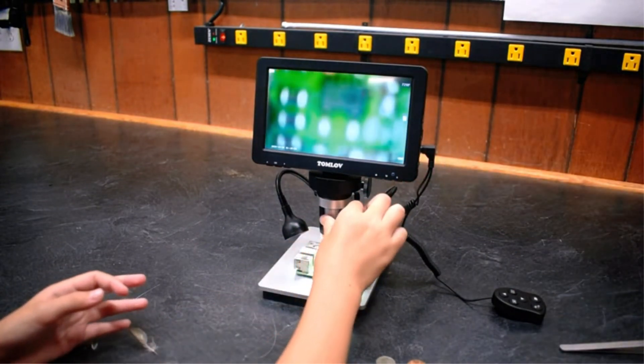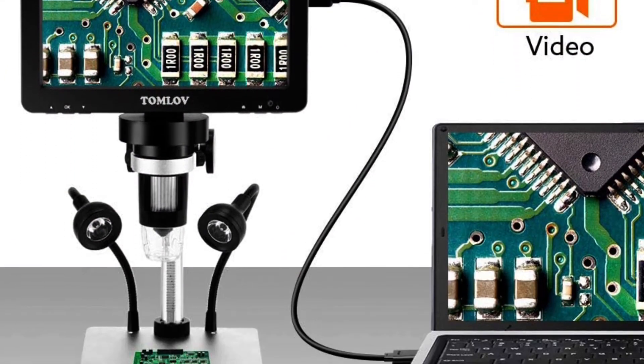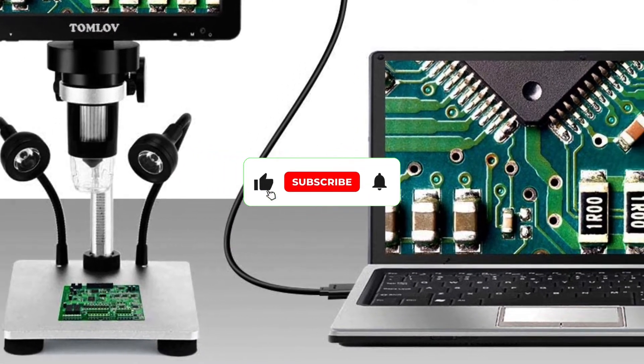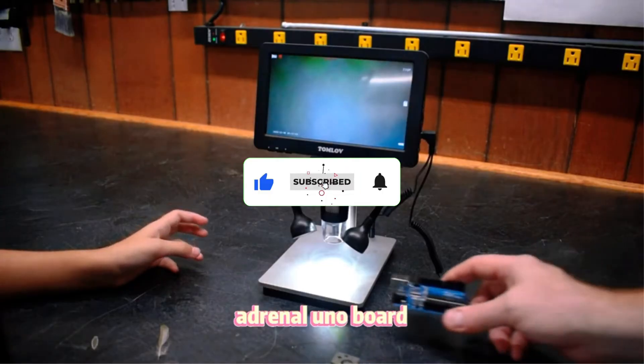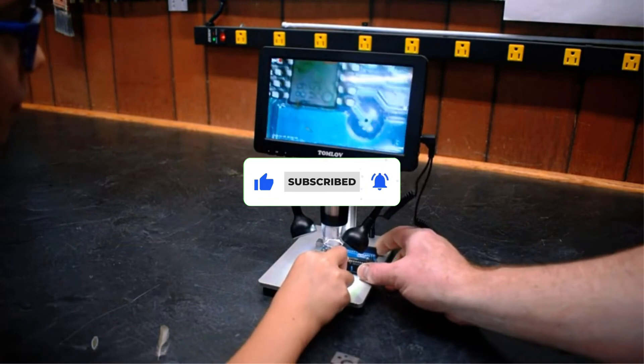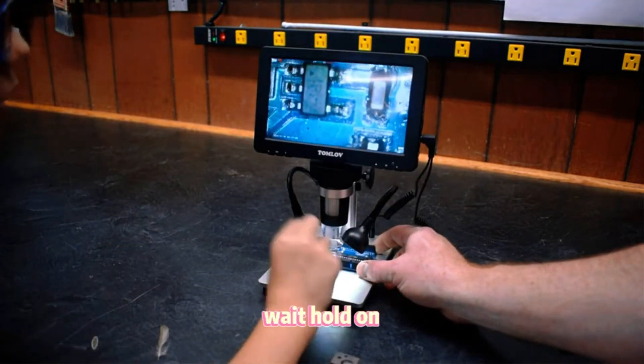You also get a pretty high zoom rating of 1200x with this microscope for seeing all the details. If you want to take photos and videos, then you can store those on the included 32GB SD card.